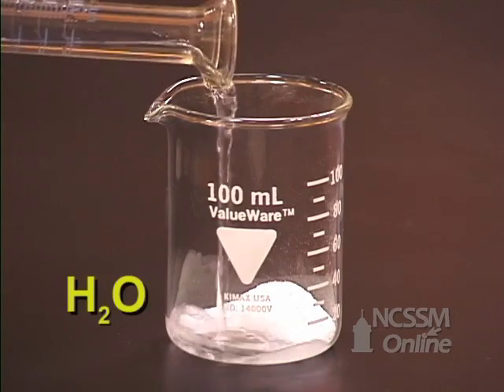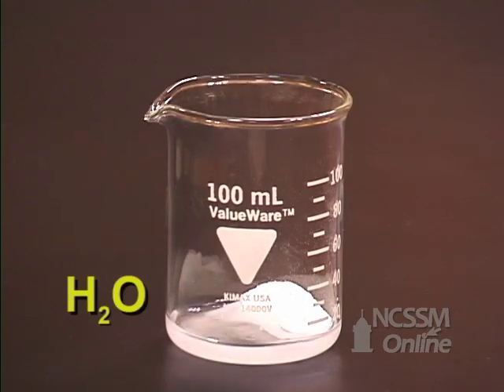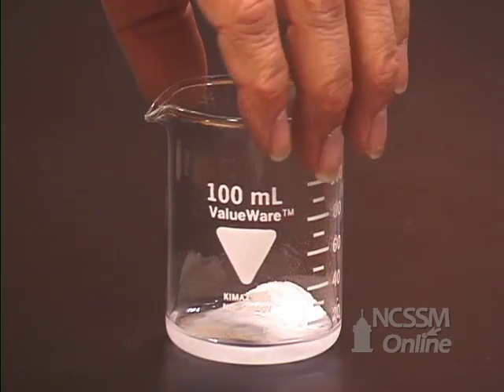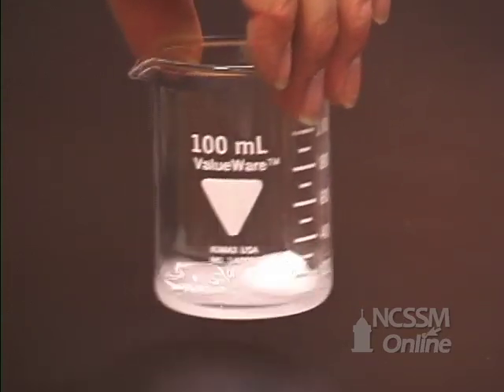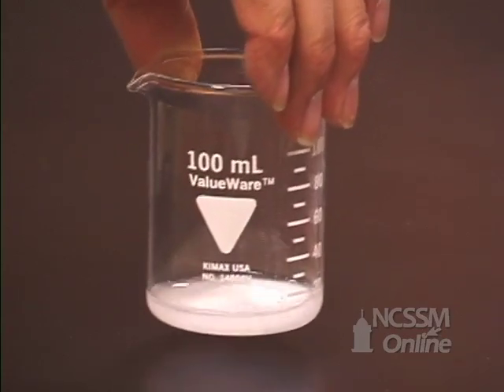Add about 5 milliliters of water to the beaker. This will help to dissolve the sodium hydrogen carbonate. Gently swirl the beaker to get some or all of the sodium hydrogen carbonate into solution.